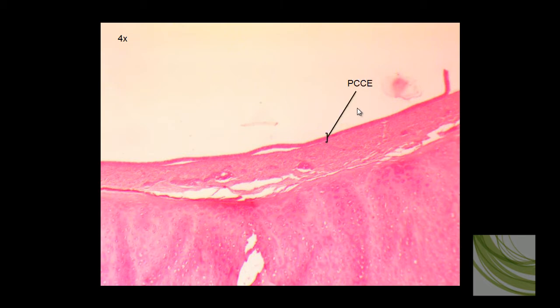Again, here is the exact layer, this darker layer of pseudostratified ciliated columnar epithelium. So we're going to want to zoom in there.